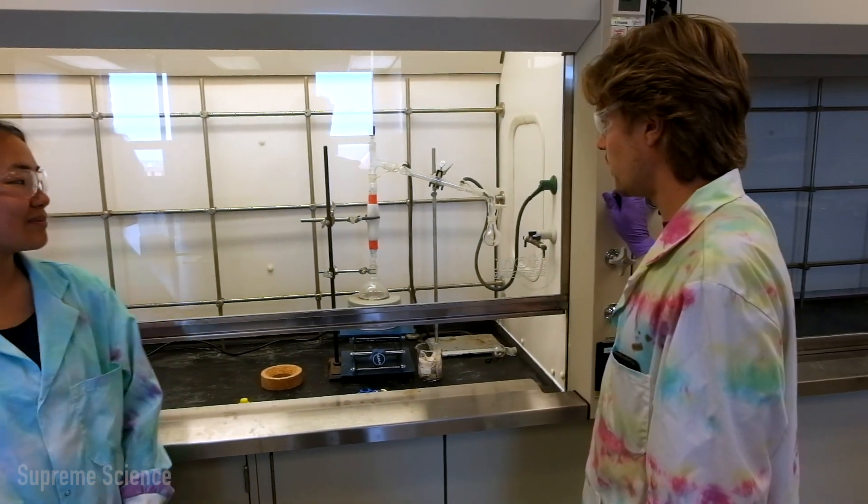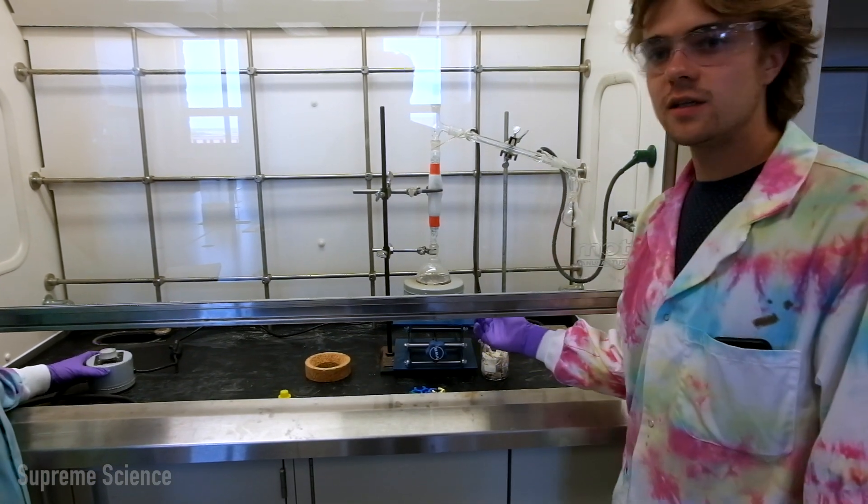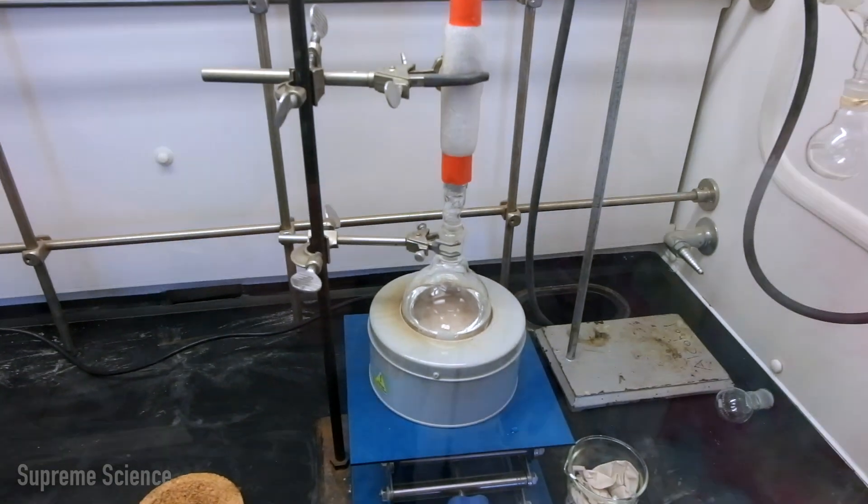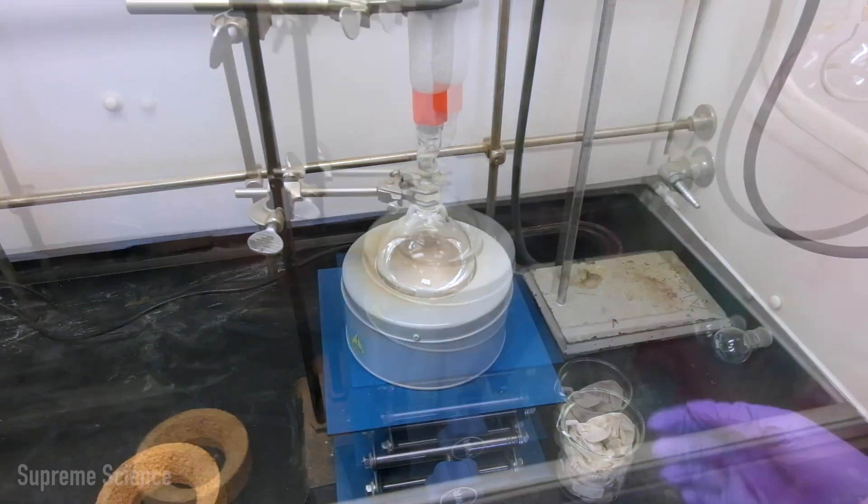Now that we have our setup how we want it, we can turn on the cold water. And we have a boiling chip in our flask to prevent bubbling over. And we are ready to start heating. So the heat is on, and we're going to let that heat for a little bit.